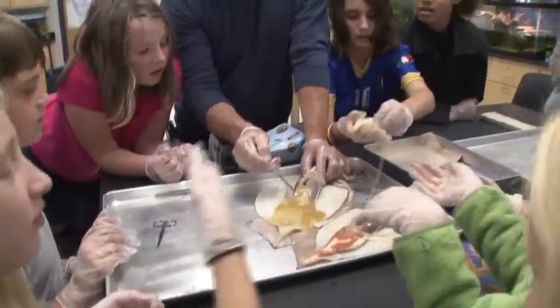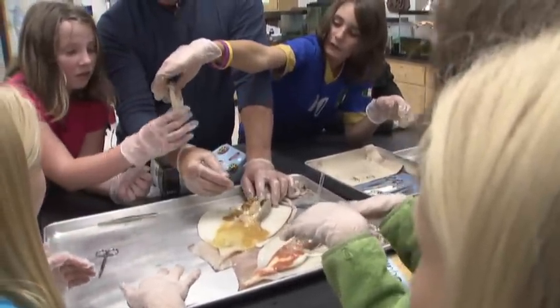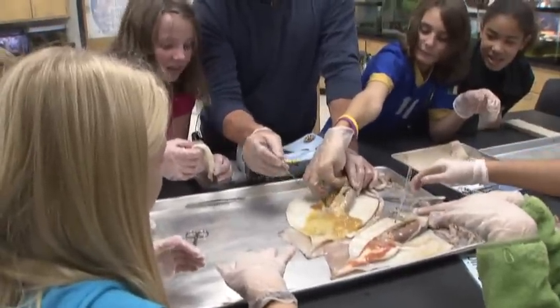Oh, digestive gland. Oh, this looks so good. Looks like chili, doesn't it? I want to eat it. Who wants this? You guys want any of that? The chili? Sure, you guys can feel that.